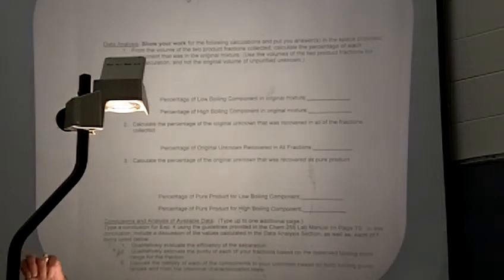So you're going to take the volume of the two purified components, add them together, and then take the volume of each one divided by that total and figure out what that percentage is. So you're just looking at the relative percentage or ratio of what you collected. And that should be representative of what was in your unknown when you started.